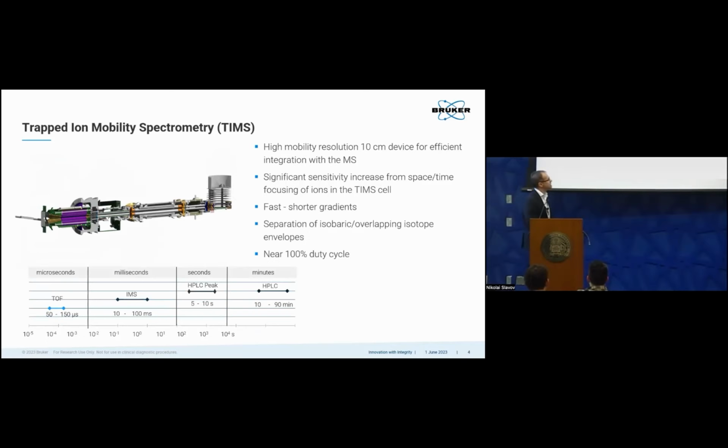So that's really the basics here. When we put this on a QTOF type system in the timsTOF, this is where the system sits. This is the part which is doing the ion mobility. Just to orientate you, we have the transfer capillary here, a deflection plate to push ions through an ion funnel. This is our TIMS analyzer, the two TIMS analyzers as we saw before, so basically less than 10 centimeters here. After that, we have a multipole, quadrupole, collision cell and the orthogonal acceleration into the time of flight system.